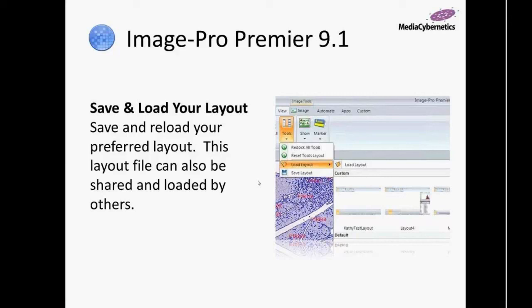Now that Windows user has their own settings folders and all of the settings in Image Pro will locate themselves there. If you log in as Windows user number 2, you'll find that the layout actually reverts back to the default. And that's no fault of the program except for that we're actually saving those layouts for each Windows user.